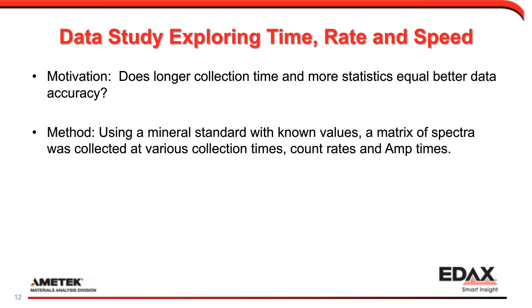In times past, we had much slower process times, and because of the slower process times, we had to choose either, say, a 40 microsecond time constant, or amp time, or an 80 microsecond amp time. And one would allow us to process the counts longer, provide more stable results, which gave us better resolution, say 131 eV. Whereas when we would want to work for maps, we would work at a faster process time, say the 40 microsecond time constant, which would allow higher count rates and increase our productivity. But the compromise was that we would work at resolutions in the range of 160 or 180 eV or even poorer. So we accepted that compromise. It even, in fact, became a rule of thumb. And that rule of thumb is something that I'm questioning now, and I'm going to show some examples of data that will allow us to see why when we work at faster process times, we're able to get quality results quickly.